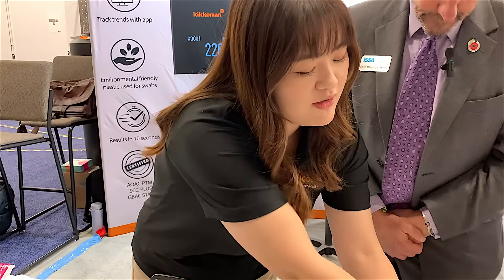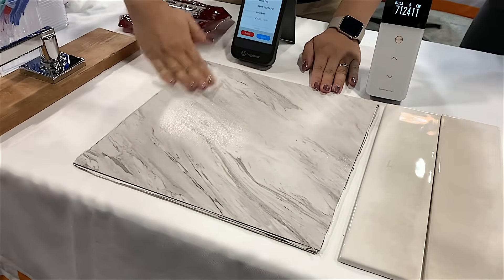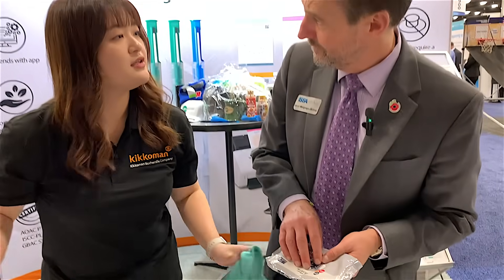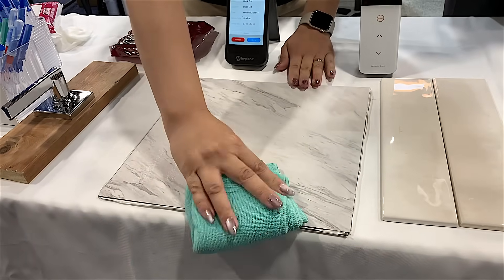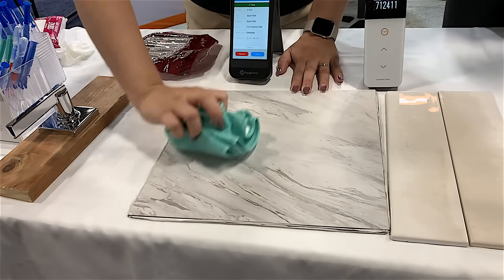So next, I will be cleaning the surface with an alcohol wipe. This is a wet wipe — slightly wet, so that moisture is acting as a solvent. Alyssa used some pressure on the surface because we actually have to remove the soils, the dirt, the contaminants, and the microorganisms, the germs — which she's done. You can see that was a simple wipe in both directions, like you would clean any surface. And now she's going to use a dry microfiber — no chemicals. This is just a dry microfiber, which acts like a magnet and attracts all the dirt, taking soils off the surface.